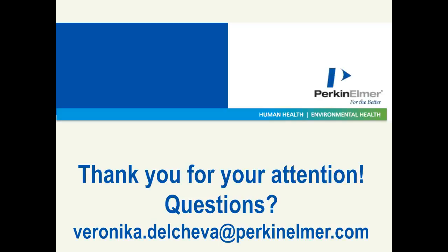Now we work the opposite way, where we analyze everything on the LabChip, and then we save money by eliminating any samples that have failed at any point in the reaction. We don't send them on to downstream sequencing processes, which I think is a big cost saving for the department because it is expensive technology. So, specifically, I can't answer your question with actual numbers. And, of course, labour: the user now just loads the plate, which takes 10-15 minutes, and then they can run that chip all day for four consecutive full plates. Compared to the labour of gelling that many samples, it would be a lot. I can only assume that. I can't give a big number.